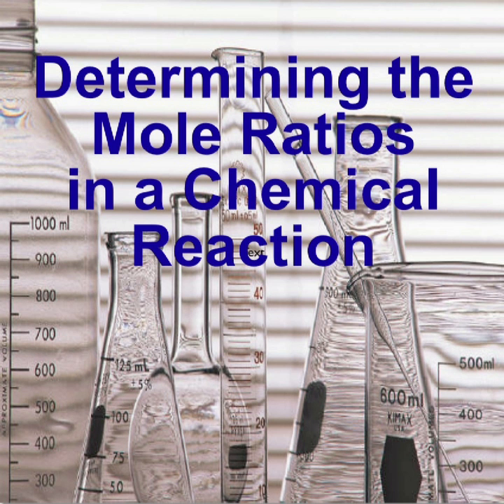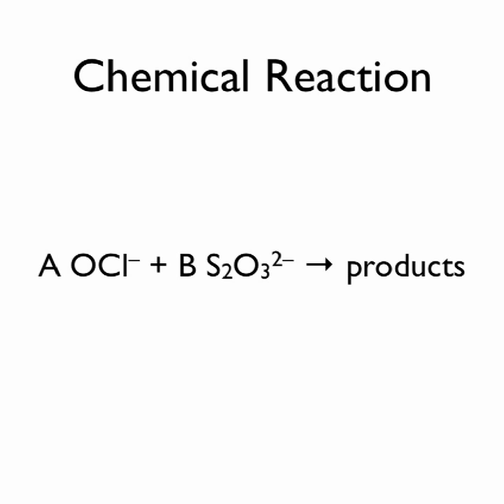In this week's laboratory, determining the mole ratios in a chemical reaction, we will have our first data acquisition use of the Vernier interface and Logger Pro system. But first, a balanced chemical reaction equation gives the mole ratios of the reactants and the products as coefficients. When some of the chemical formulas are not known, an experiment must be conducted to help determine the mole ratios.